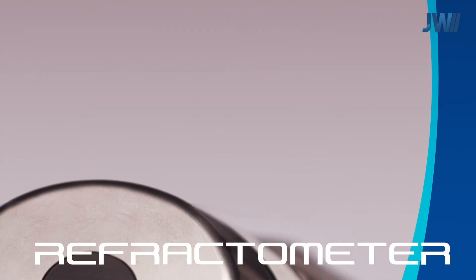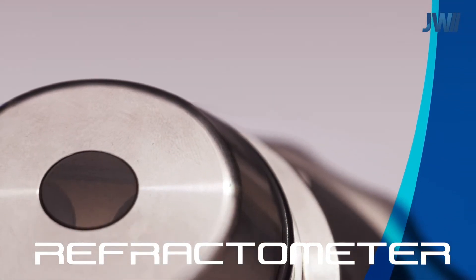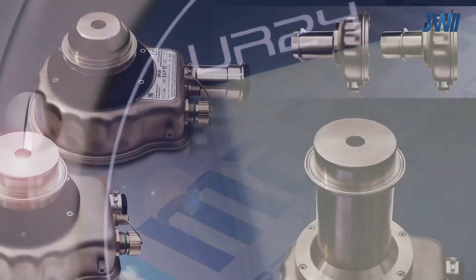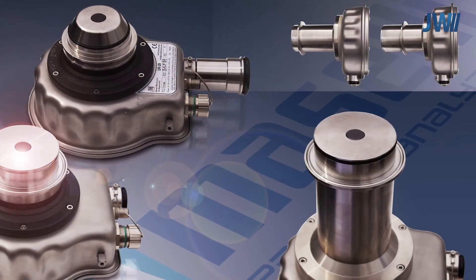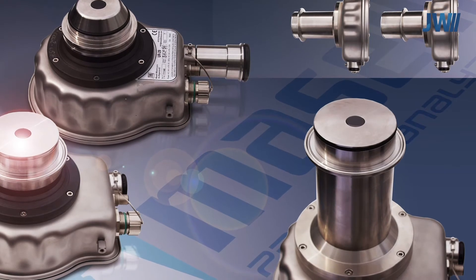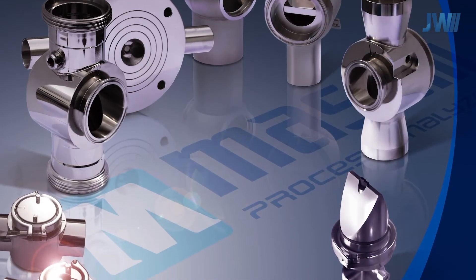Our UR series refractometers can be used in a diverse range of applications, from food and beverage to chemical, petrochemical and many more. Here we can see the standard and long-probe version of the UR24 process refractometer. Various inline mounting fittings are available in different line sizes and materials.